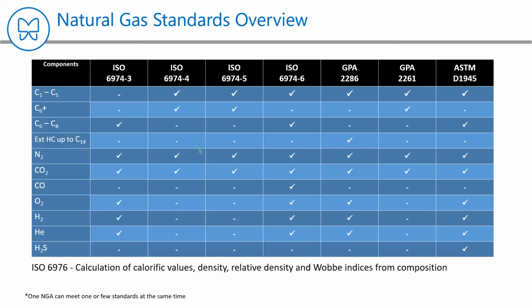So here we can see different standards of natural gas analysis. Here we can see about 7 standards, and these standards require different hardware.